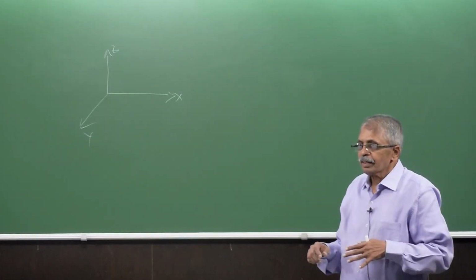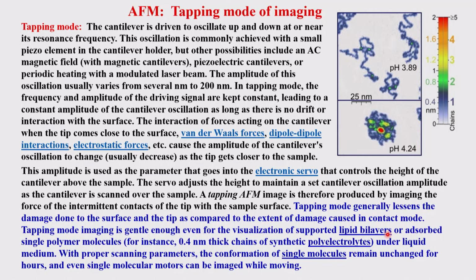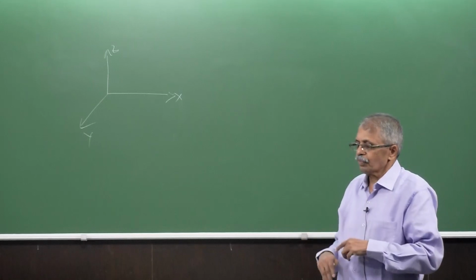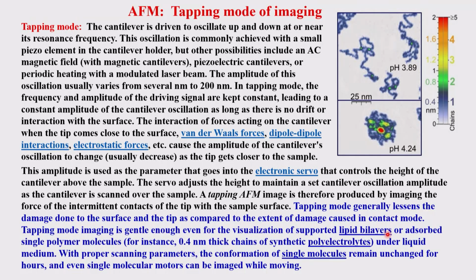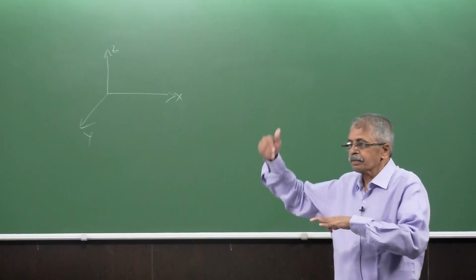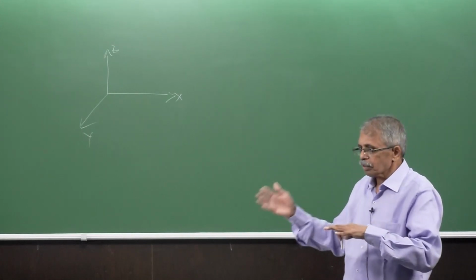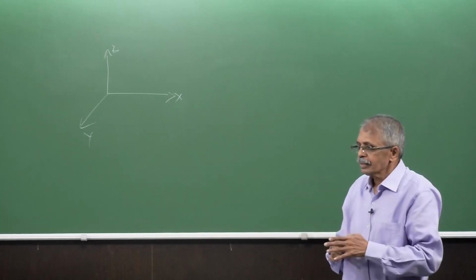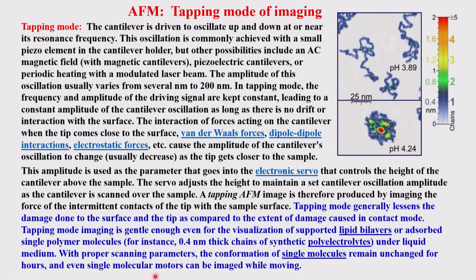on a scale, where you take some solid support and put some kind of a layer for doing some catalysis, some polymer things, or embed some kind of matrices, using the polymer as a matrix and putting other components for certain properties like conductivity or magnetic properties, etc. Then you have a layer. The layers can be studied up to a certain thickness. And if you have liquid surfaces, or layers on the surface of a liquid, these can also be studied by the tapping mode.